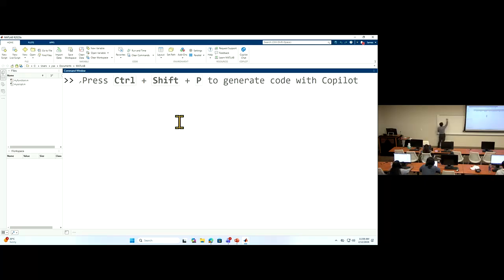Okay, so the PCA is to give you a rotation matrix, so you can apply this rotation to X. So this projection will be used as Y, okay? So this Y, then you start to visualize Y1 and 2, the first two dimensions, and then look at the distribution of your data.